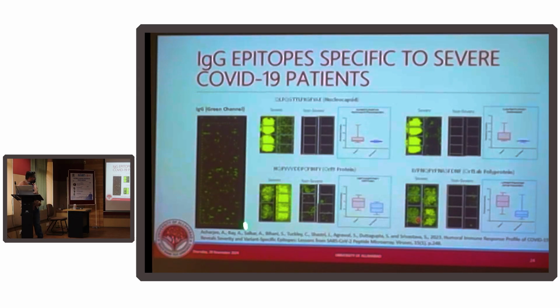So these are specific spots, and if you go back to the literature of the manufacturer, we can exactly tell what these spots are. And what you see in these boundaries is the control. What could possibly be the control? This checks for polio. It's against polio virus, and all of us are vaccinated against polio. So we would have a strong response for polio for all the patients, but this is only for SARS-CoV-2 proteome.